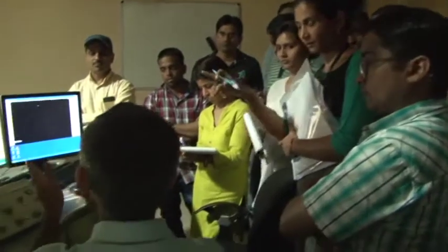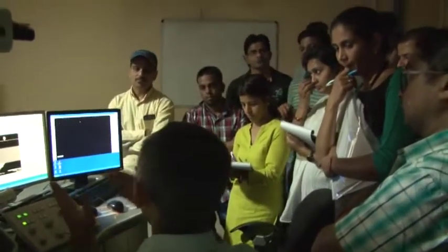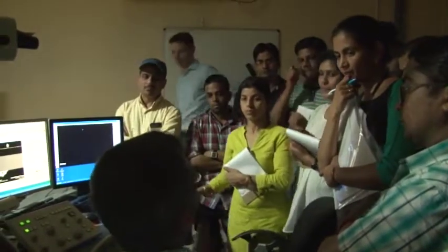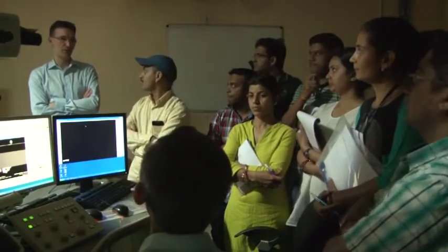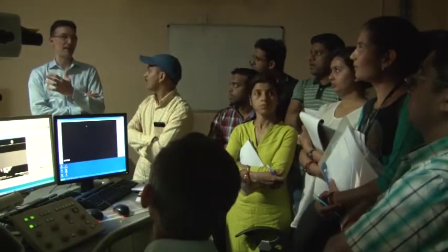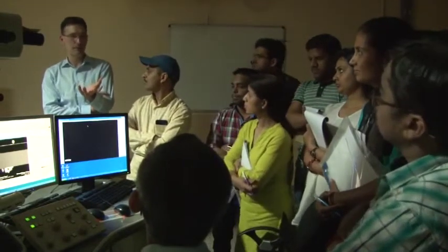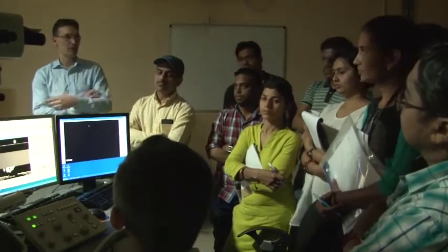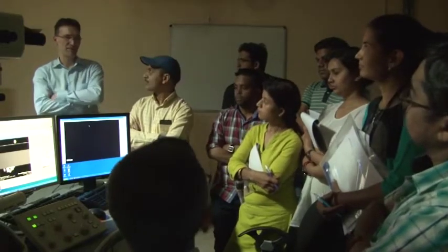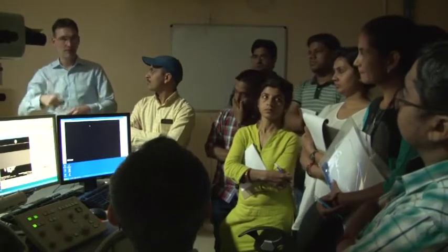They are there. So when you do the alignment, there must be some provision wherein you can save all the parameters into a file. That must be there, but I am not so much aware of how to load it. In newer microscopes, yes. If you have an older microscope from the 1980s, at Erlangen we had CM microscopes, Philips CM, there is hardly any chance. There's just a basic alignment and you have to do everything on top. So there are no user alignment files that you can save. New microscopes provide those capabilities where you just save your file.